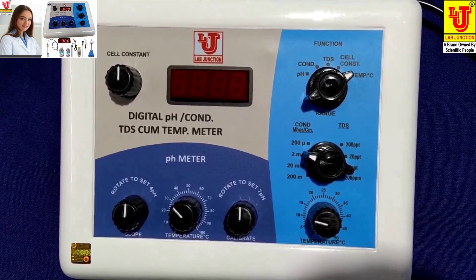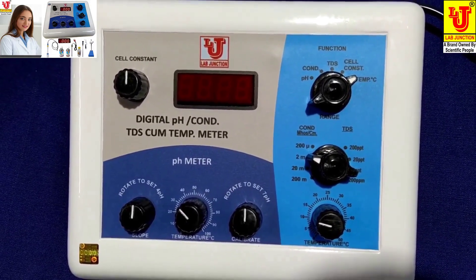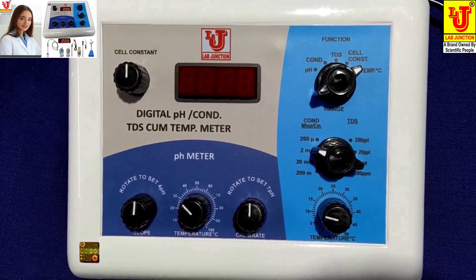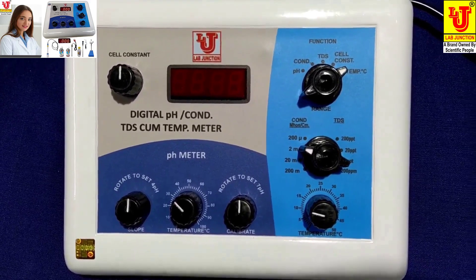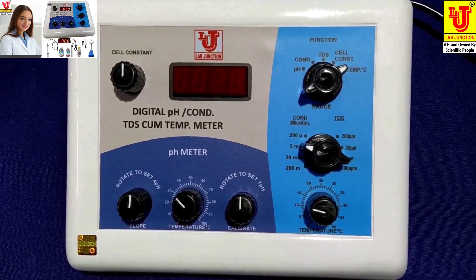One is LJ181 and one is LJ182. Both are four-in-one — four parameters in one instrument.